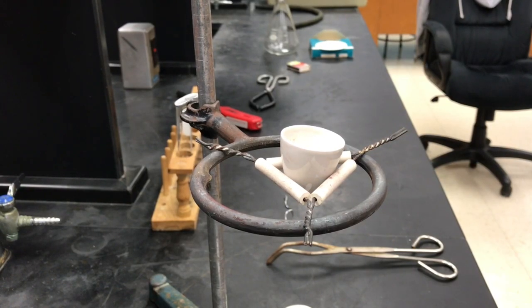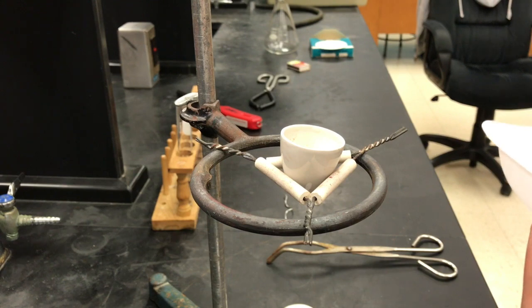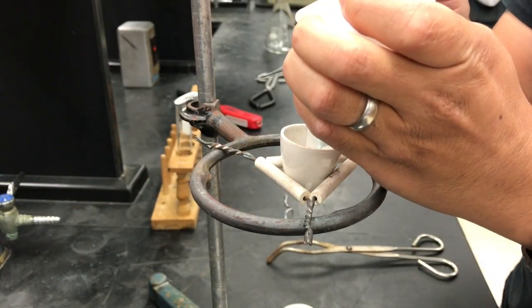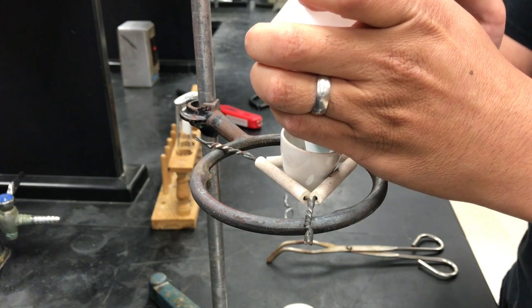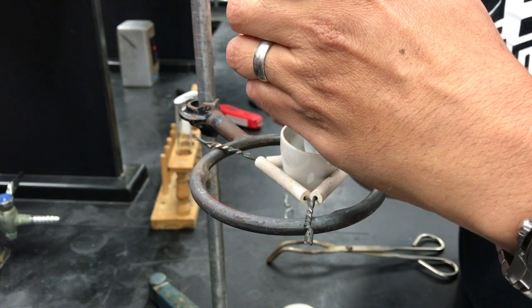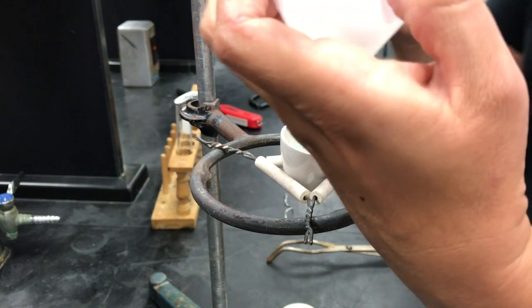Now we're going to transfer our solid sample to the crucible. So to do that, I want to minimize loss. So I'm going to fold the weighing boat and slowly pour it. Just kind of tap it down. We don't want to rush this. Might have to do some scraping. And you should check the weighing boat and see that you got it all out.